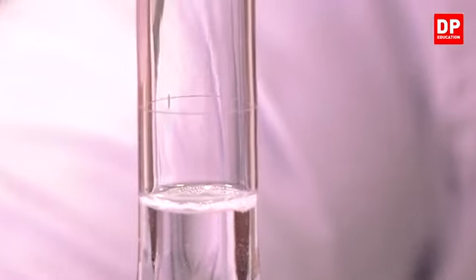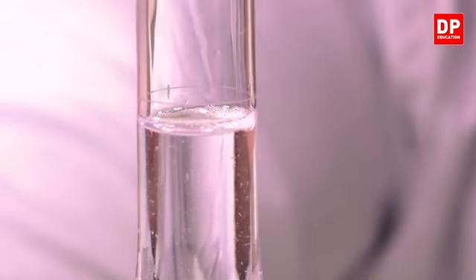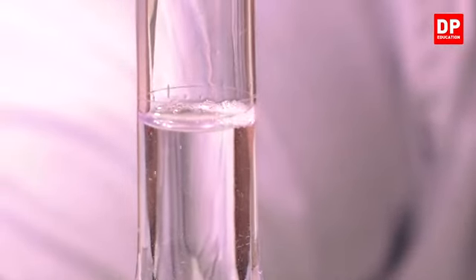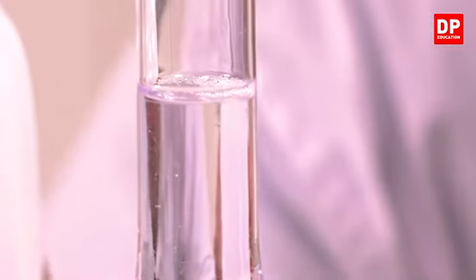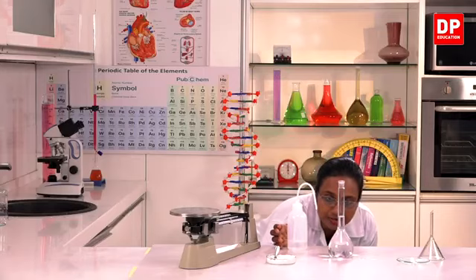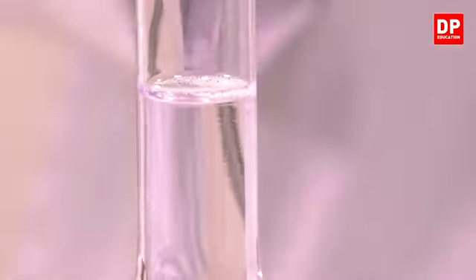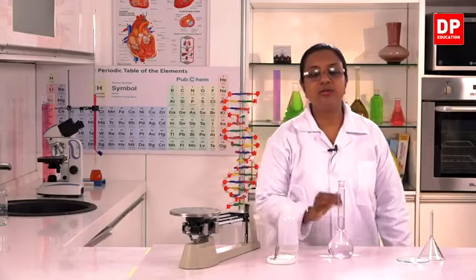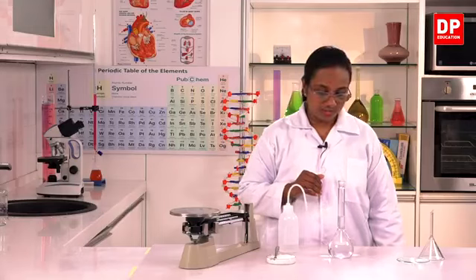So my eye level has to be along the line, and here I have to make sure that I add the correct volume of water. You can see the meniscus here, students. The bottom line of the meniscus has to be in line with the volume mark in the volumetric flask.